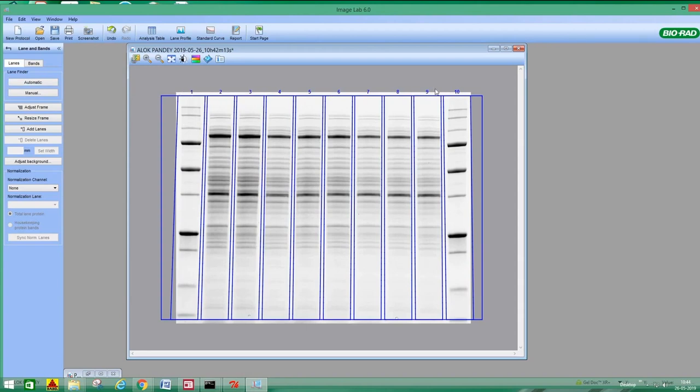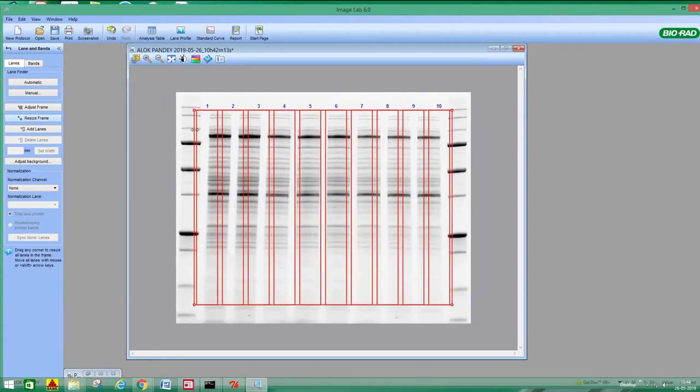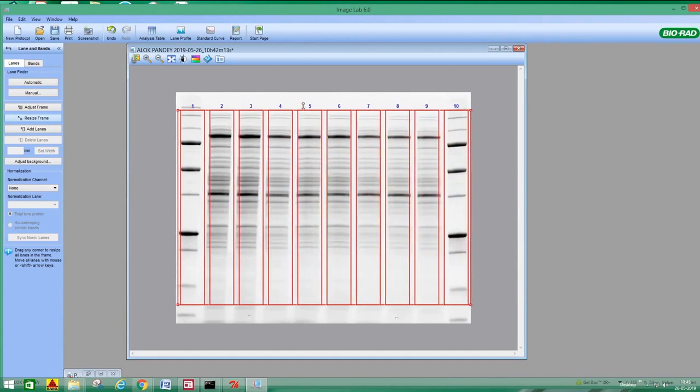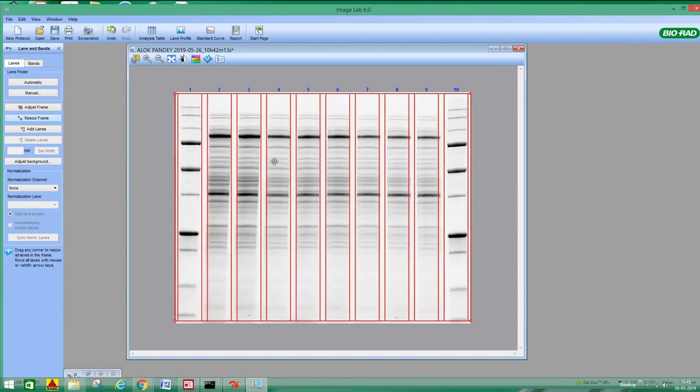you can see the lanes given on the top of the gel, 1, 2, 3, 4, 5, 6 up to 10. Or if you want to do it manually, you can. Suppose you enter the number of lanes, how many lanes are there, so 10. Here you can adjust lanes. See, this is not fitting completely, so you have to adjust it like this to get complete lanes. Now you can see the lanes are completely adjusted and fitted. So this is another way, the manual way.